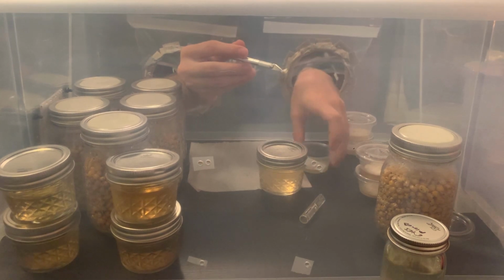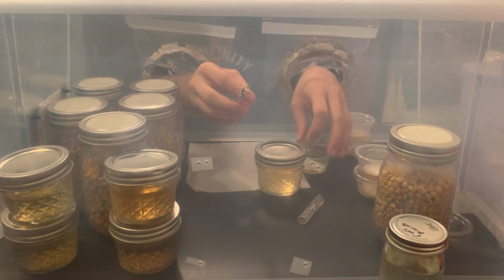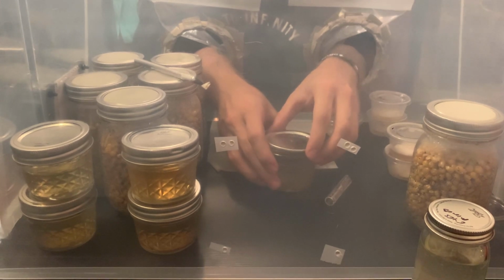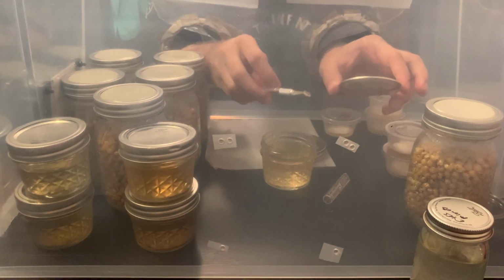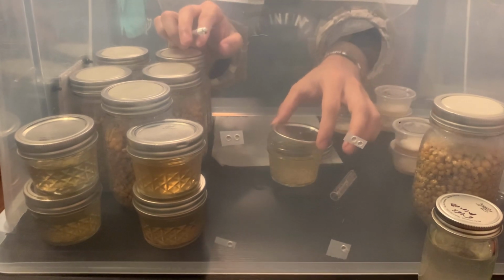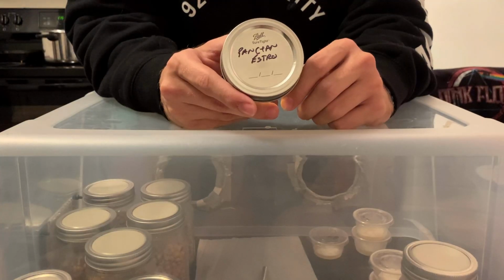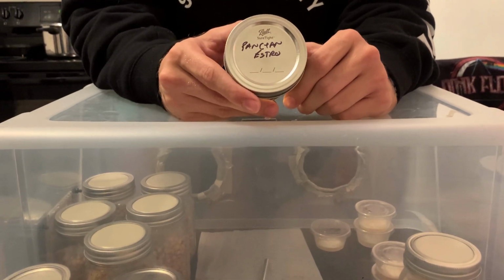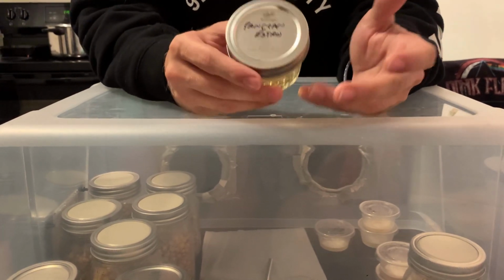Get it on your X-Acto like this. Put my lid back on that. Okay, so after you pull this out of your still air box and pop this open, because it was suction cupped shut because of the pressure cooker, that's fine. You're just going to throw your agar in like that, put the lid on, screw it up, make sure you label this. Okay, you're going to want to label these because you want to know what is in it. Don't forget to do that right after you inoculate it. You're gonna forget, you're gonna mix them up, and you're not gonna know what is in each jar.